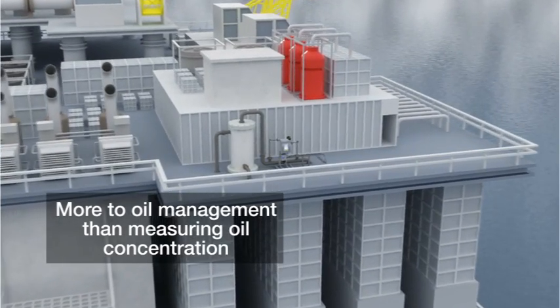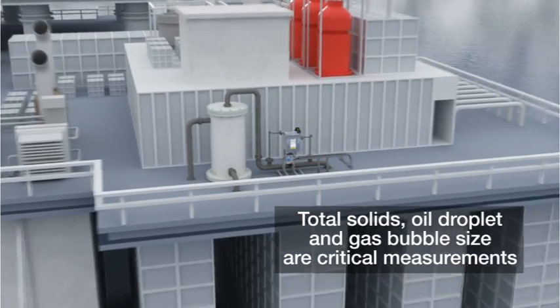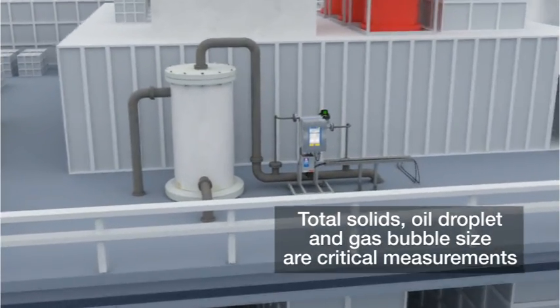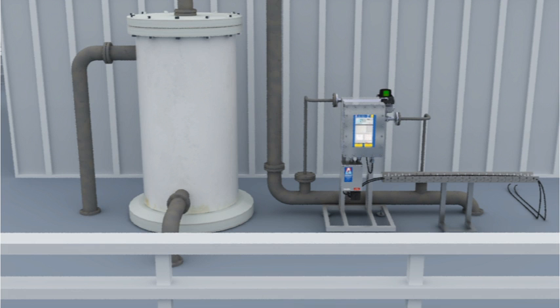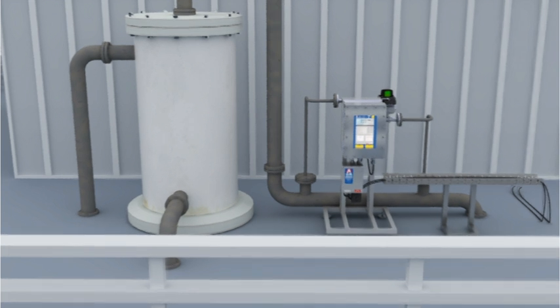There is much more to water management than simply monitoring oil concentration. Total suspended solids, oil droplet size and gas bubble size are critical measurements at certain process steps within a produced water system.